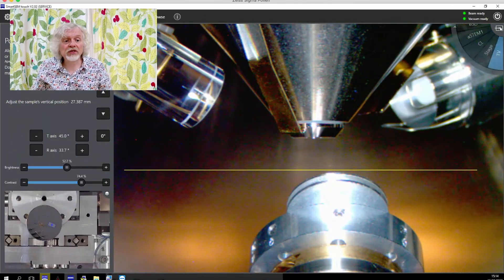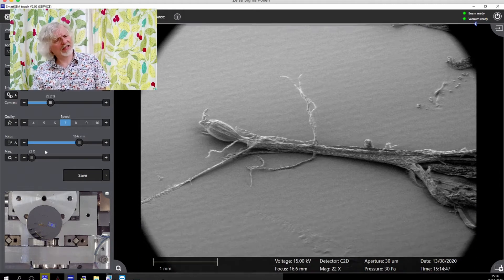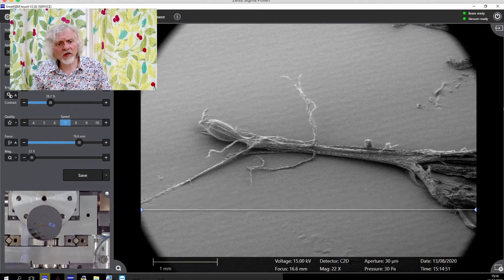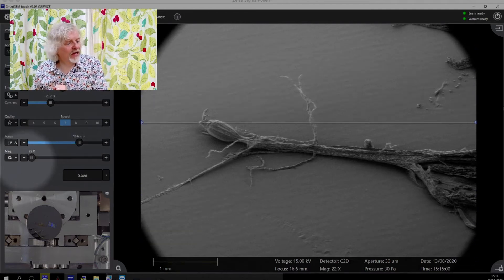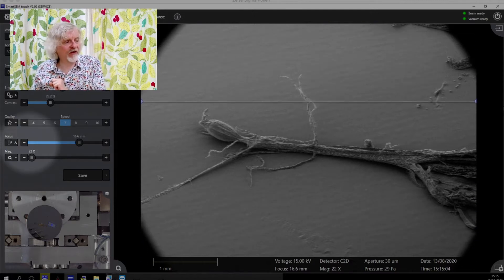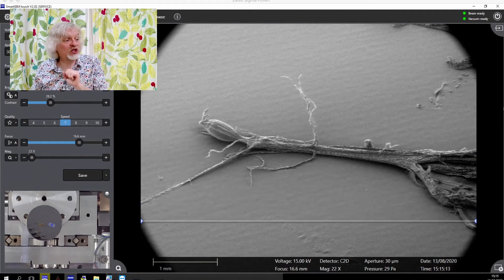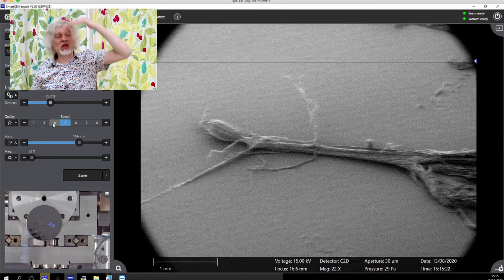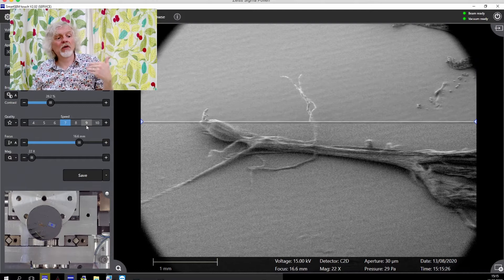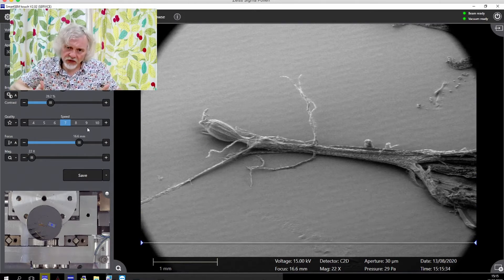If I go to the actual image itself — this is now the image you see of the tiny little floret. There's a scale bar at the bottom: one millimetre. The magnification is 22 times. There's focus, and there's quality. I can mess around with these controls because I am in control of this microscope even though it's in Cambridge. If I speed up the quality, it scans faster but you get a lower quality. I can slow it down and it scans slower but you get a better quality. When you take a picture, you slow it right down to get the most resolution. And I can zoom in as well.